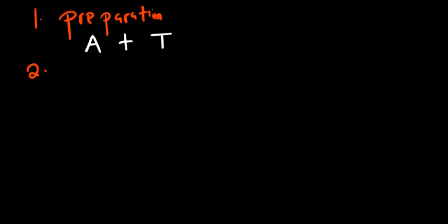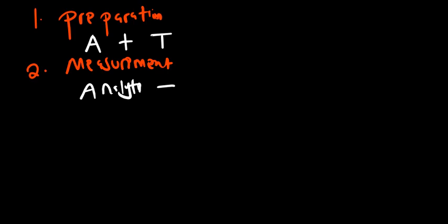Number two, you measure now. So you have to measure the volume of the analyte. So the analyte, if you're measuring the volume of the analyte, you're going to be using a pipette.